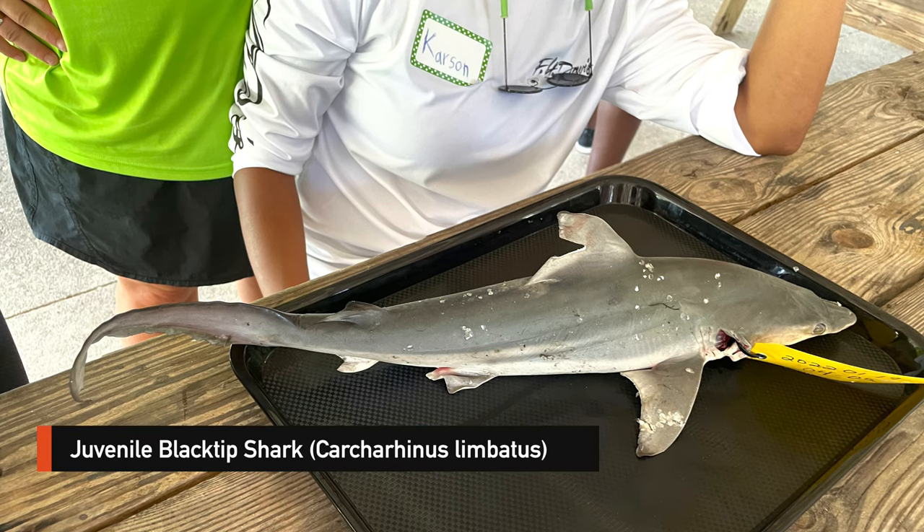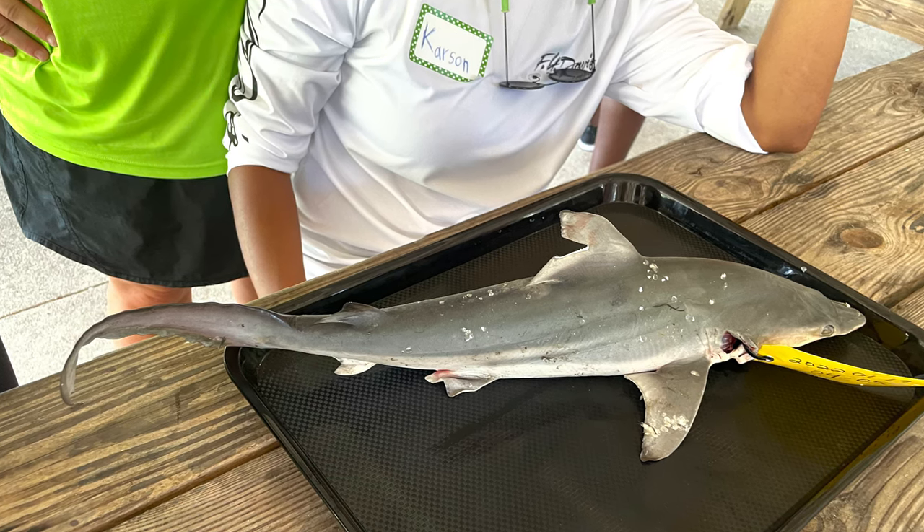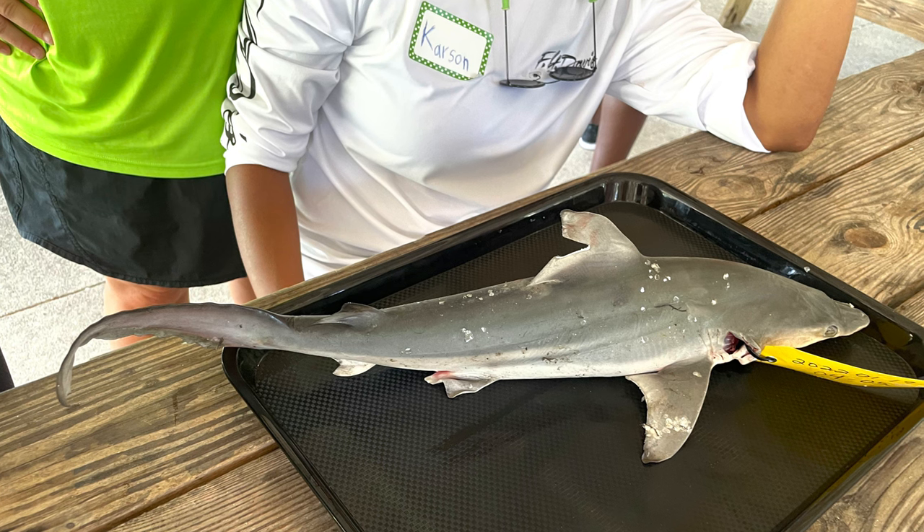In this video we will be taking the jaws from two blacktip sharks, one male and one female, ranging in size from two to two and a half feet. Here's the male, who's a young of the year, meaning that he was less than a year old.